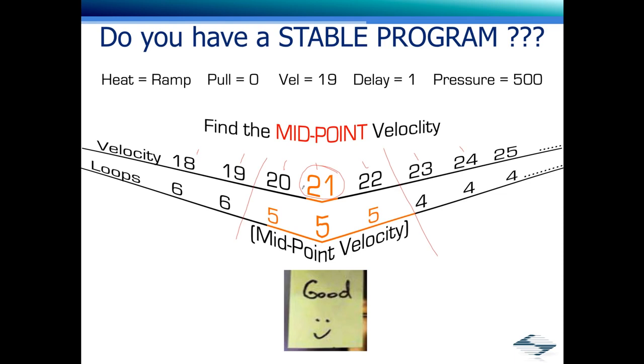You want to make sure those roll smoothly, and you spin them, and they hopefully turn around a number of times before they stop. So you could have some mechanical issues if you're running into a boatload of variability and you've already gone through all the steps that have been recommended.